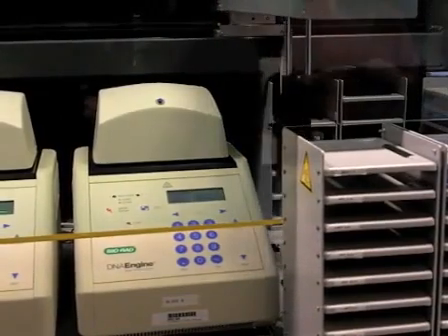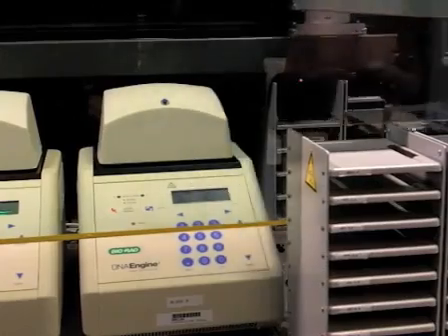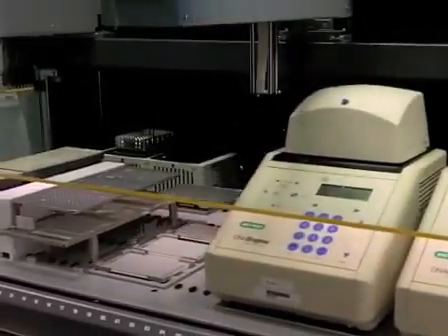The final step of the process is the transfer of the reaction mix to optical plates for the development of color.